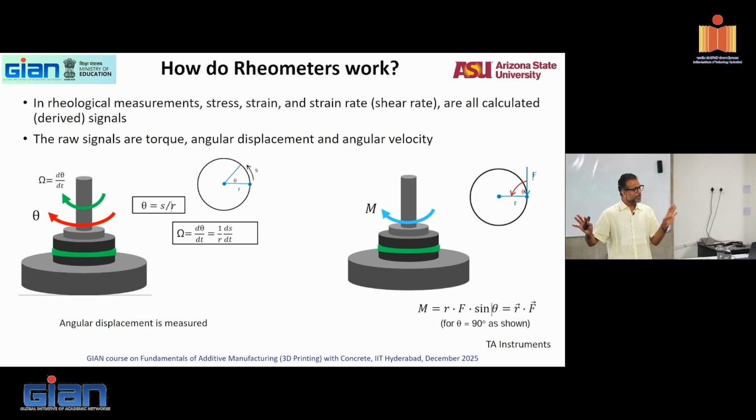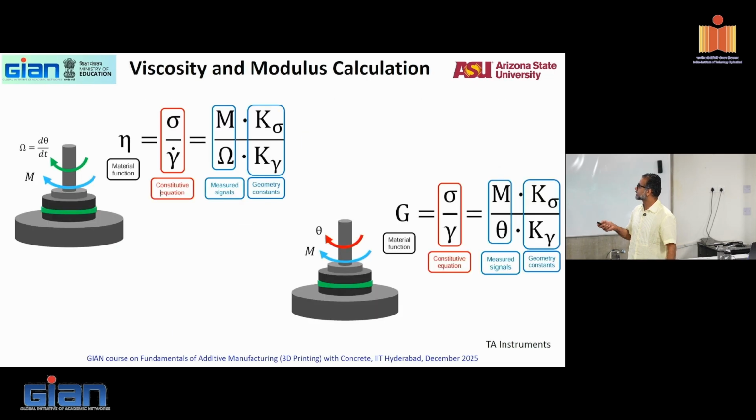You really don't have to know any of this. I'm just giving it to you so that you know the theory and you're not using your rheometer as a black box. The instrument manufacturer knows his geometry and his geometry constants well. He would have given you the conversion factors in the software, in your computer, in your instrument itself. You don't have to do any of those. But just to show you on the back side how things work.